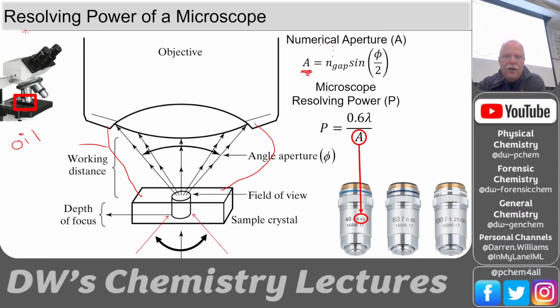So this A here has to do with the refractive index of this gap here. And so if we want to resolve smaller features, then we want to increase this numerical aperture. And we can do that by putting oil or something with a high refractive index in this gap. Okay.